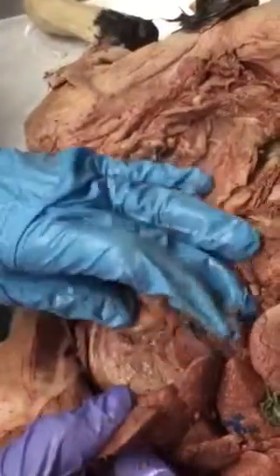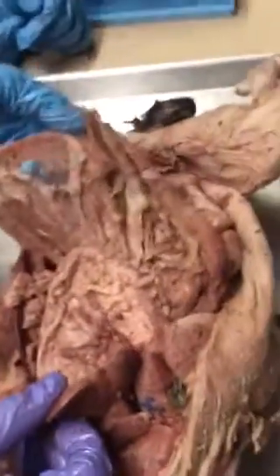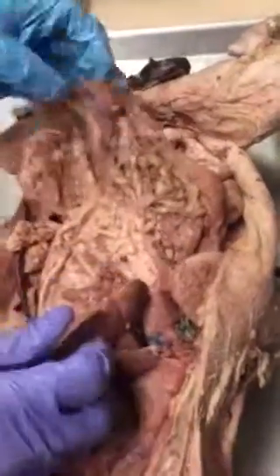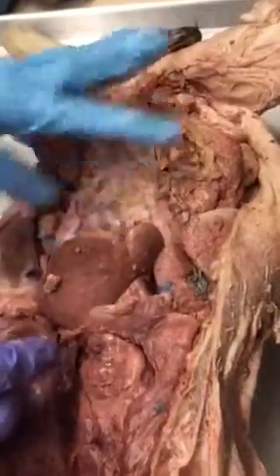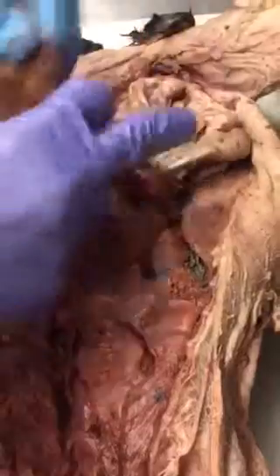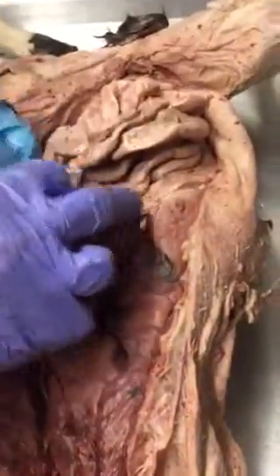There's a lesser omentum too that extends up to the liver, but I'm not going to ask you to know that one. Just know the big one. If it looks like a cargo net, just say greater omentum. Okay, so stomach here, spleen, liver, gallbladder, diaphragm, greater omentum. We're going to move that out of the way.